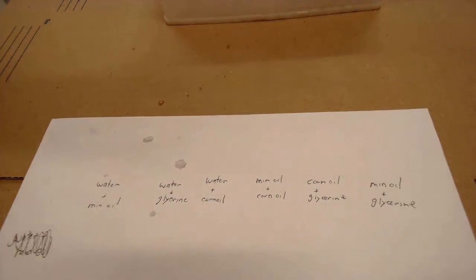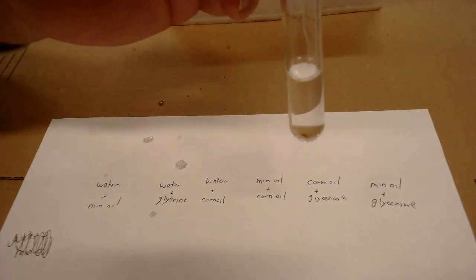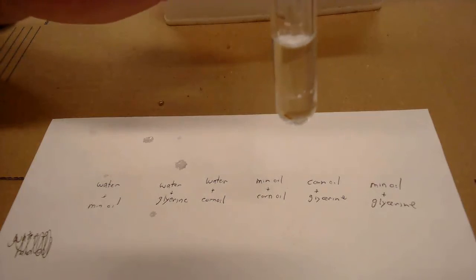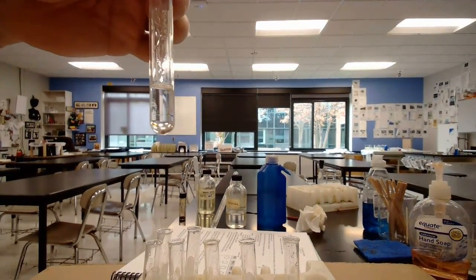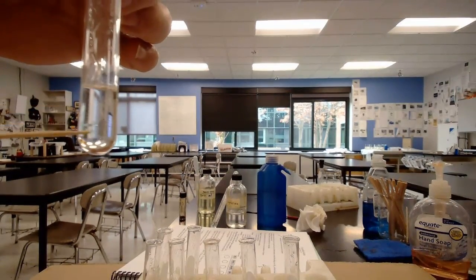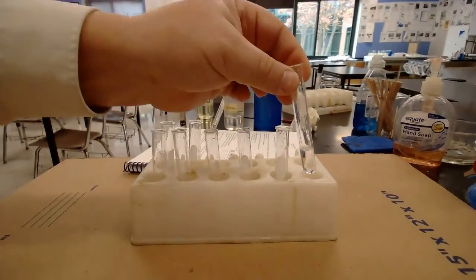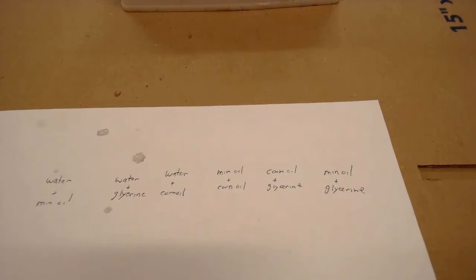And the last one is mineral oil and glycerin. We mix those two together. When you take a quick glance at it, you might be able to see a line right down here. Hold it up to the light — see that little line right there? Really hard to see because they're both about the same color, but right about there is where they separate. So they are not mixing together. Those are your results for the second part of the lab. Now watch the second video — it will help you interpret what you just saw.